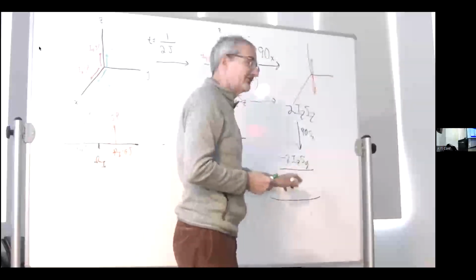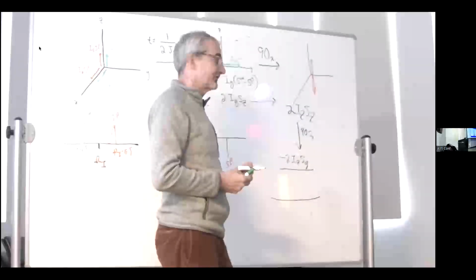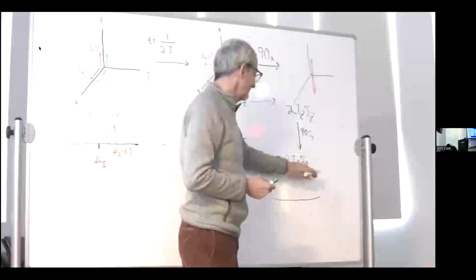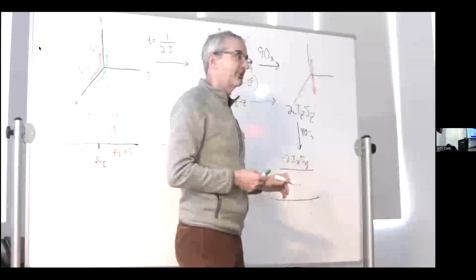There's my frequency axis. What am I going to see? It's going to be an antiphase doublet. And what frequency will it be centered on?